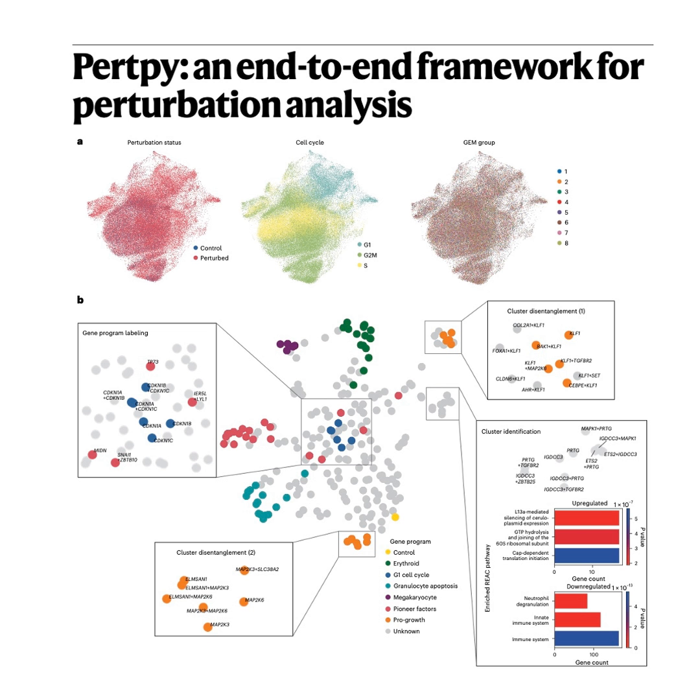That's a great summary. Okay, this brings us to the most compelling part. What did this framework actually uncover? Let's talk real-world biological insights. Let's start with case study 1, finding new gene programs in a big CRISPR activation screen. This was the Norman et al. study, over 111,000 cells. Pertpy used that MLP classifier space we talked about to refine the original findings.